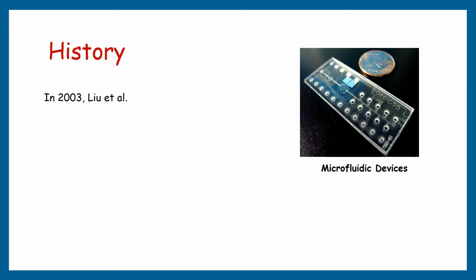In 2003, Liu et al. reformed the technique by adding microfluidic elements. To increase the accuracy of dilution and reduce the operation-derived error, micropumps and microvalves were introduced to partition liquids from DNA templates. But the use of microfluidic technique was still restricted due to high-cost chips.